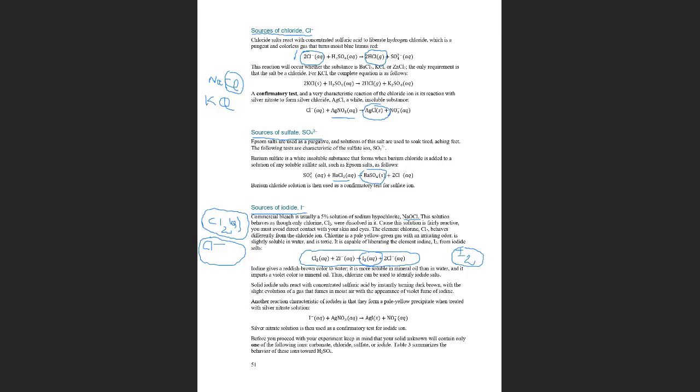There is another way that we are going to perform that is here. It says solid iodide salts react with concentrated sulfuric acid. So when we do that reaction, immediately we are going to see a dark brown, and this is another reaction to test iodide.